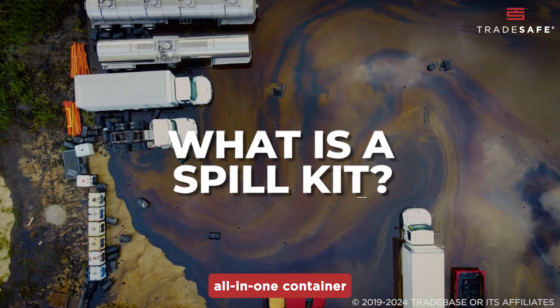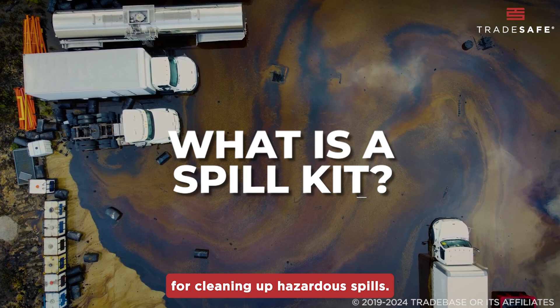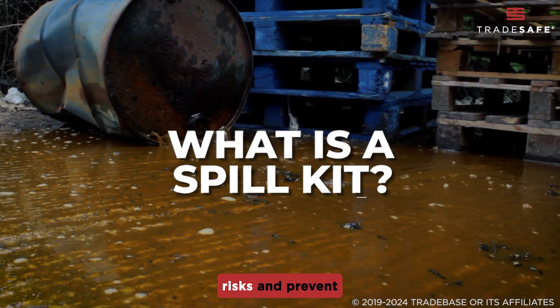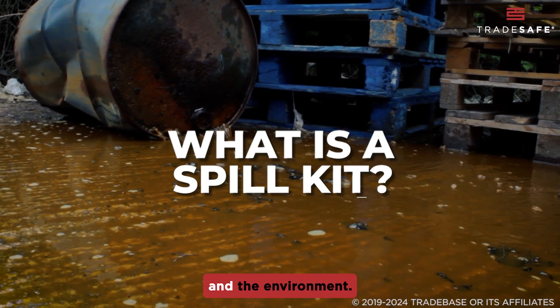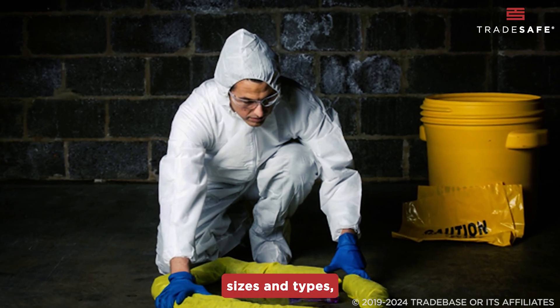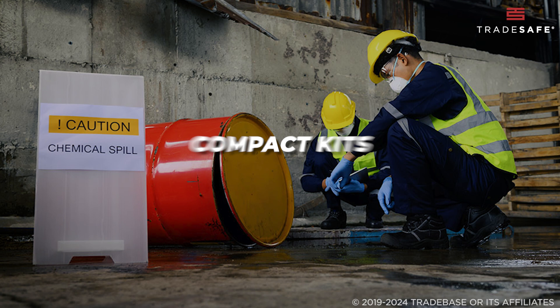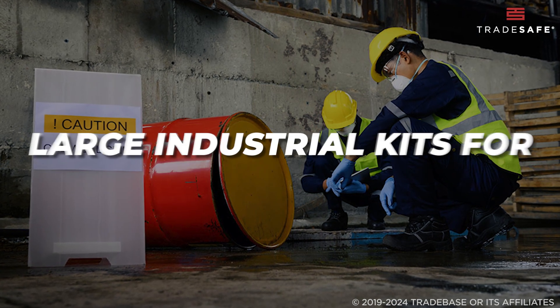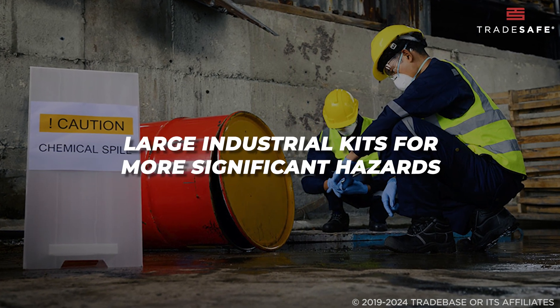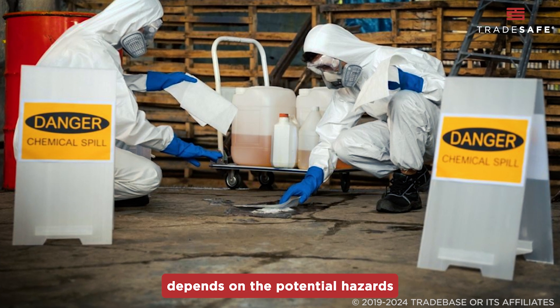A spill kit is an all-in-one container storing equipment and gear for cleaning up hazardous spills. They're designed to help mitigate risks and prevent potential harm to people and the environment. Spill kits come in various sizes and types, each tailored to specific spill scenarios. You'll find compact kits for smaller spills and large industrial kits for more significant hazards. The type of spill kit you need depends on the potential hazards in your workplace.